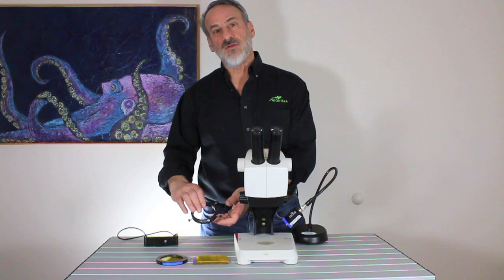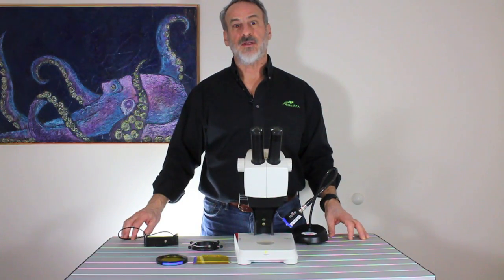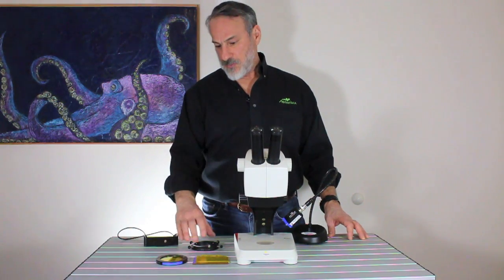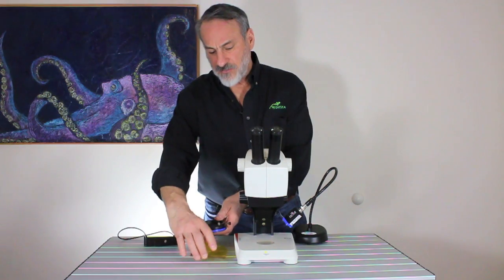Our standard microscope adapter is a ring that attaches around the bottom of an objective housing where a ring light would attach. The ring adjusts to different diameters by means of the thumbscrews. The ring is used for holding the barrier filters, which attach magnetically, and the barrier filter shield.